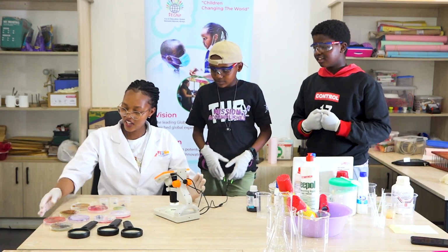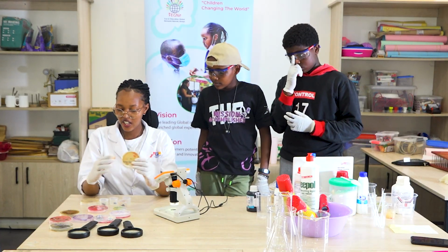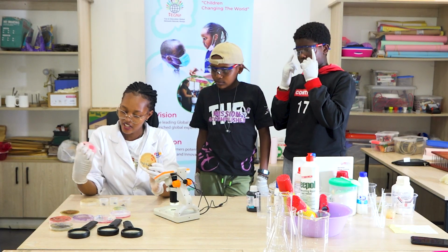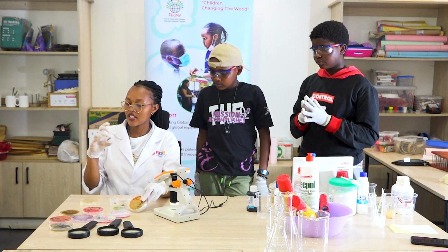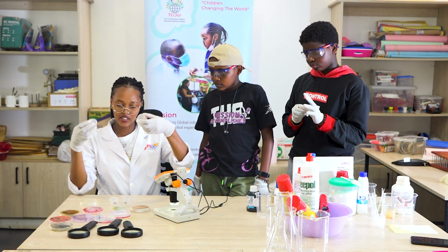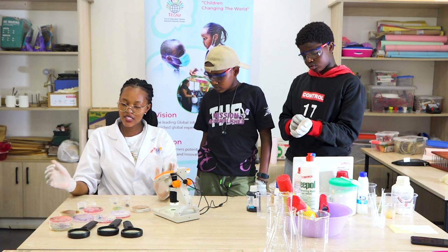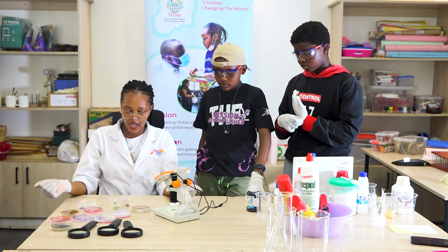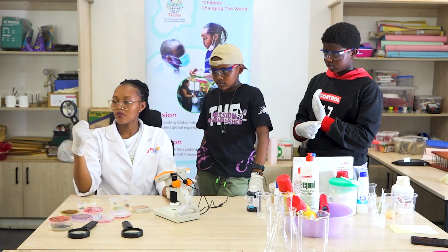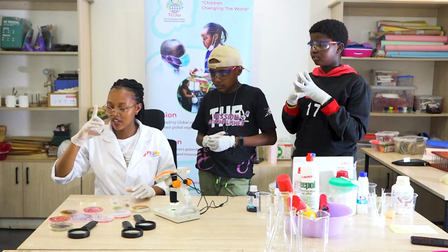Yes, so over here we have the biology corner. I have some bacteria and some fungi and some live insects. I have an insect over here and some millipedes. So we're going to visualize them, try to see them, study them using our eyes, using this magnifying lens, and also by the use of a microscope.